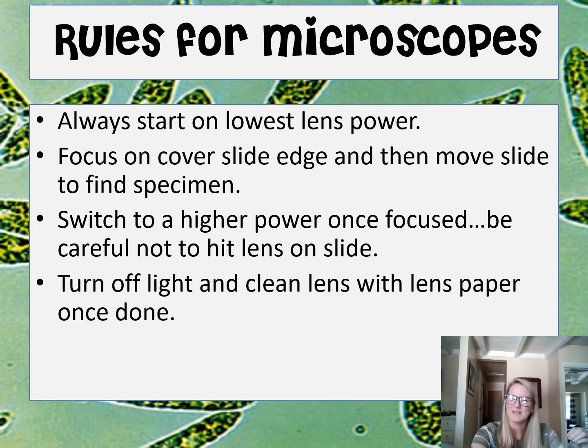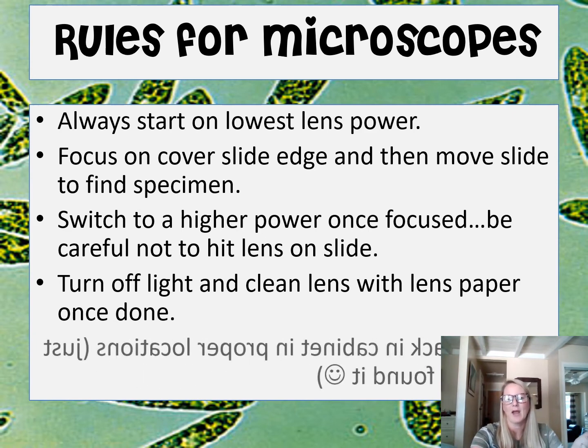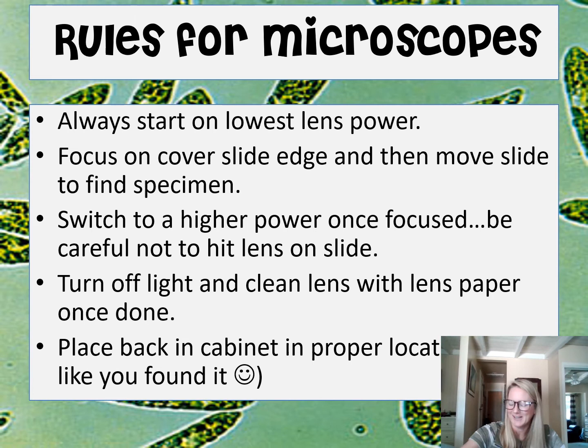Also, be sure to always clean the microscopes when you're done with lens paper, especially the eyepiece. Many people wear eye makeup, and when they look at the microscope, their eye makeup can get onto the eyepiece. So just make sure you clean with lens paper afterwards. And if we were at Dominguez, you would know to put them back into the cabinet. They're all numbered. Just make sure to put them back the way they went.